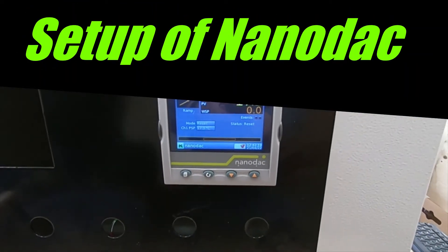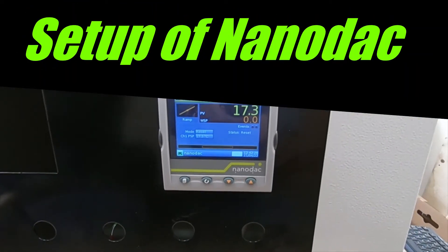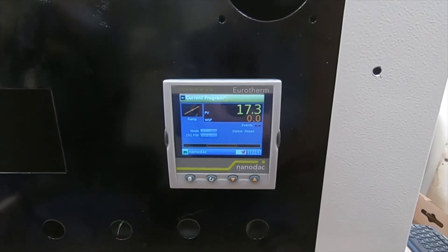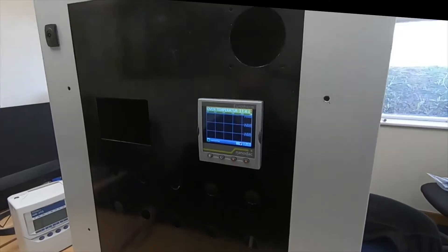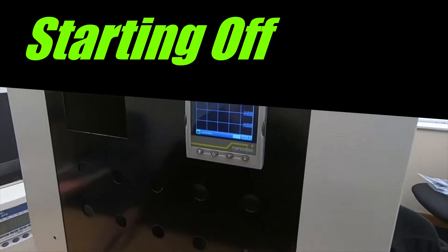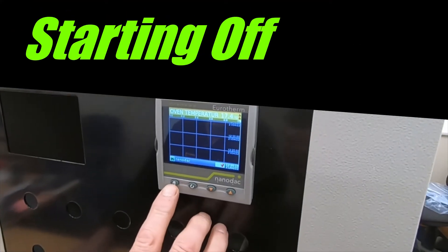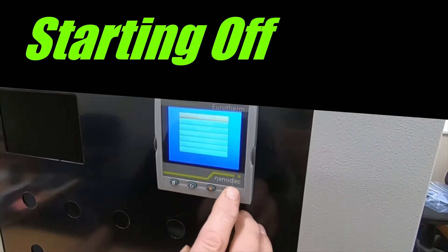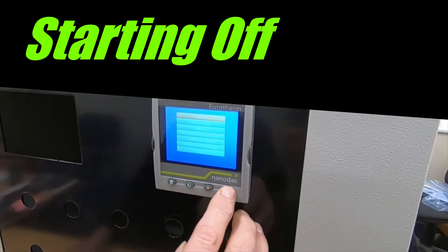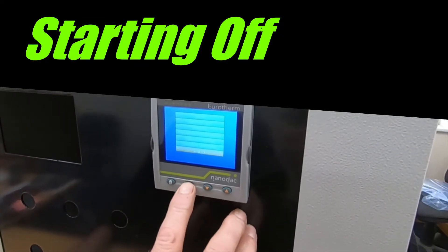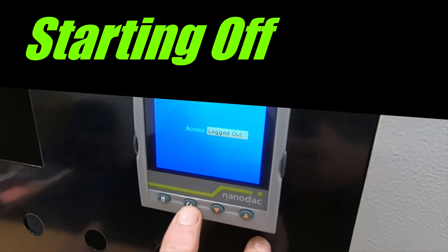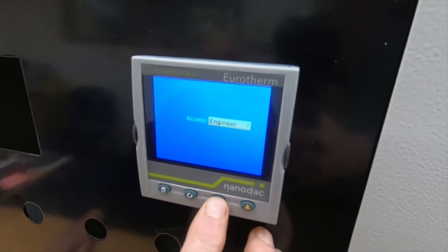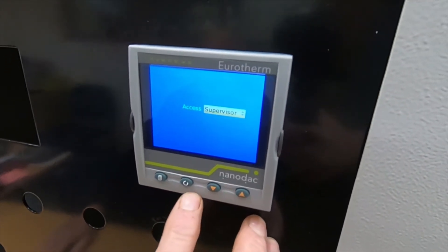We're going to have a look at how to do the basic setup and run of a Eurotherm Nanodac programme. The first thing we press is the page button. We need to log in, press the scroll button, and select supervisor.